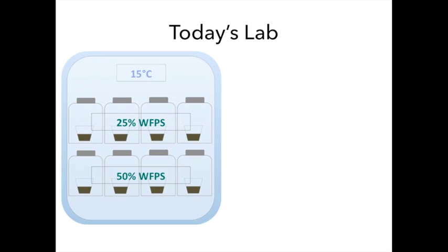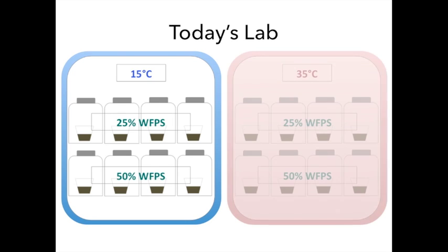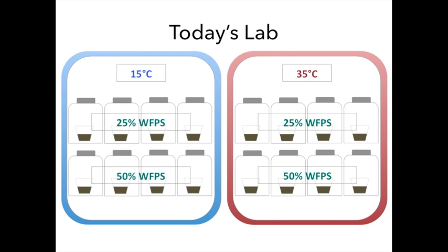These will go in a 15 degrees Celsius incubator, and we will have another full set of samples at 35 degrees Celsius. In this way, we can simultaneously test the effects of moisture and temperature on the rate of soil CO2 efflux. Let's get started.